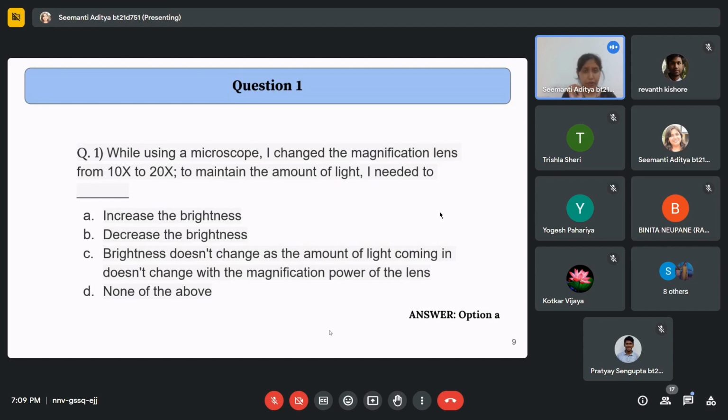If we want to see cells which are very dim, not showing actively bright fluorescence, then we have to increase the exposure time in order to observe that fluorescence. This generally happens in many cases where the expression level of that protein is very low, and in order to detect it, we have to increase the exposure time, the amount of time the cells are exposed to that light.